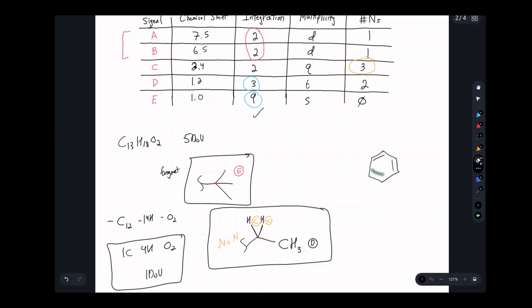So we know that this benzene has 4 hydrogens on it. Let's say that we had 2 different groups here that had this relationship where they were 1 carbon in between them. This wouldn't work. And the reason for that is that it would lead to 4 unique and distinct signals, right? This signal is closer to this group. This signal is closer to this group. Now, if those 2 groups were the same, they could potentially be symmetrical. But despite that, this hydrogen would always be unique along with this one. We wouldn't see that pattern of 2 signals with 2 integration.